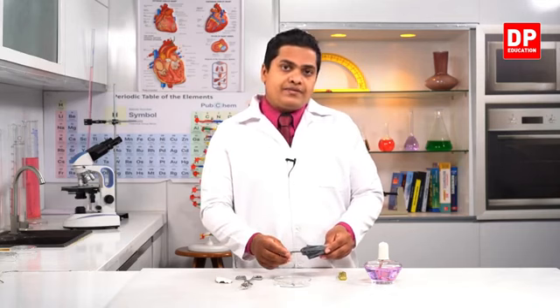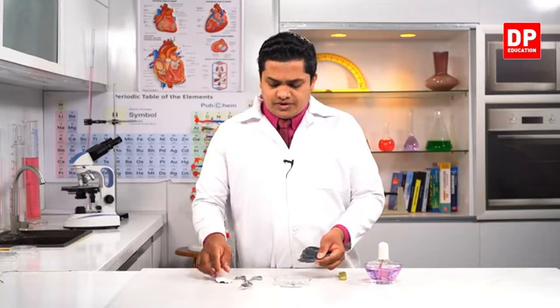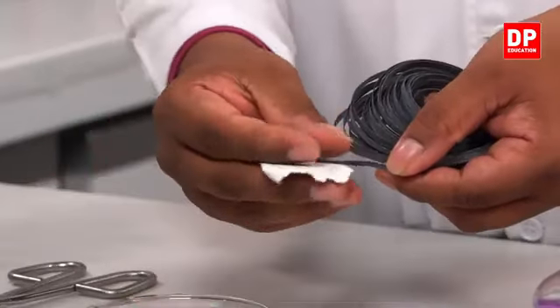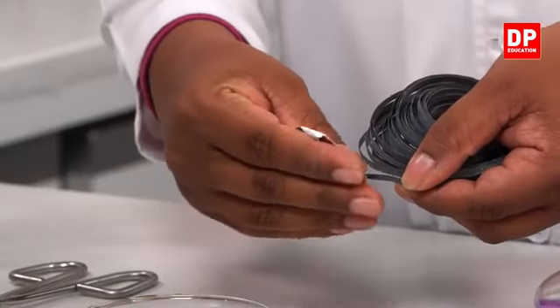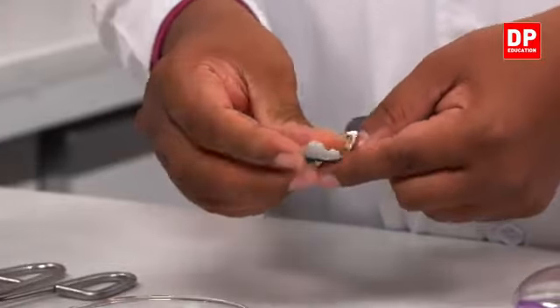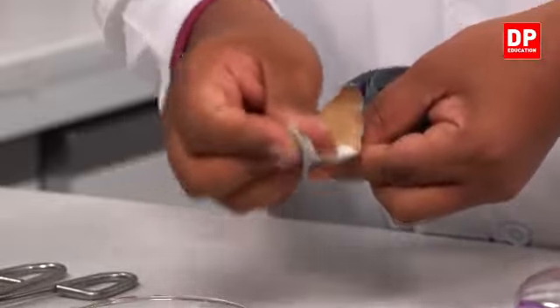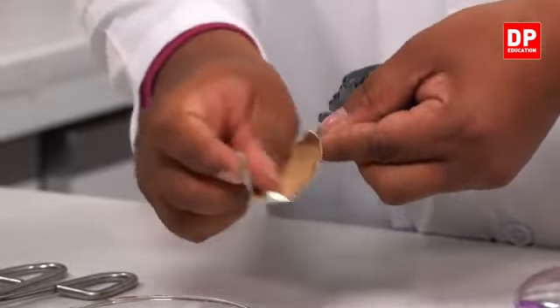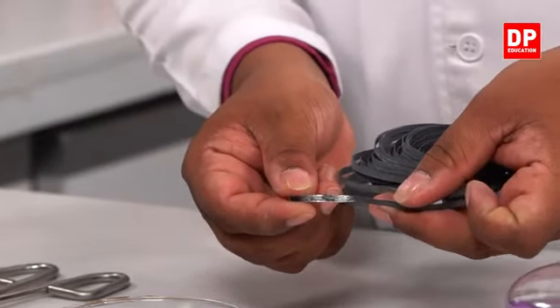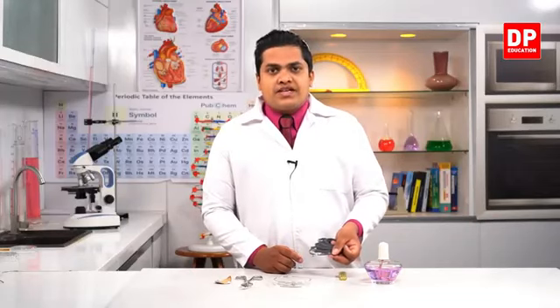So when you are using magnesium for an experiment, by using a small bit of sandpaper, you have to scratch it. When you scratch it very well like this, right? You can get the metallic luster of magnesium once again. See, you can observe the shiny surface. But magnesium is highly reactive.